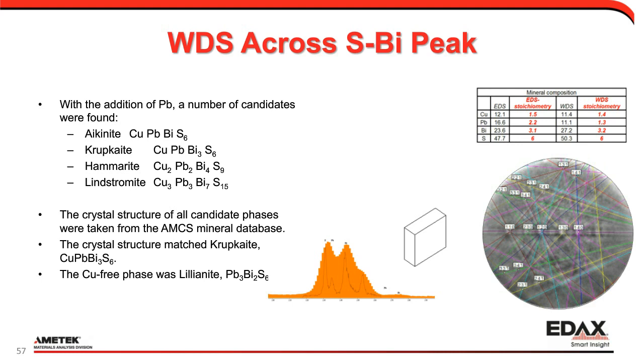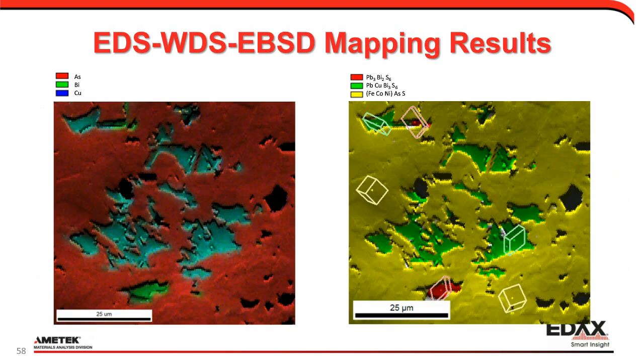And then one that's lillianite, that now we can actually do our EBSD pattern indexing once we have the correct structures. So now we can go and measure both the elemental information there on the left, correlate that all together to get the structural and phase maps on the right there for the EBSD. So WDS buys us some better elemental sensitivity and resolution, peak resolution within the spectra.